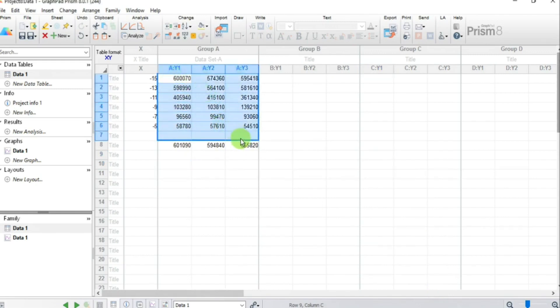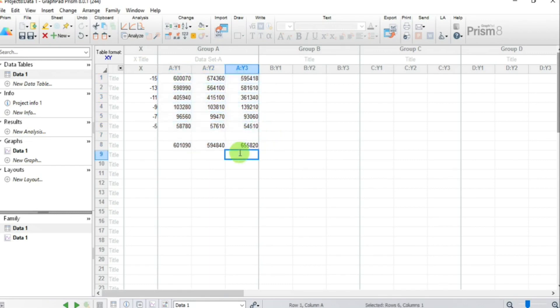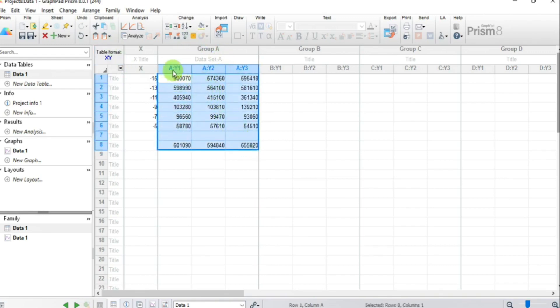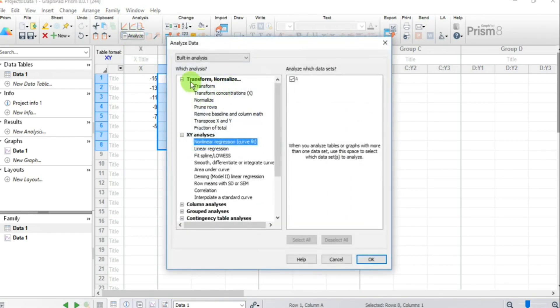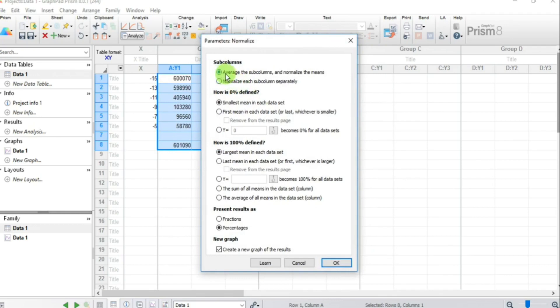Next we need to transform our Y values into percent values, because we are interested in a percent response or percent inhibition of our compound. To convert these values into percentages, click Analyze, then go to Transform and Normalize, and select Normalize. Hit OK.